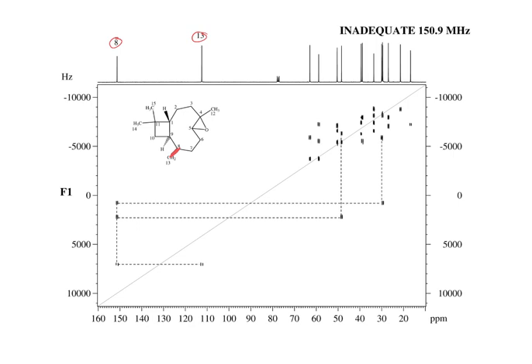Well, I guess this experiment is run to observe all those sizes of coupling constants for some reason. It seems like oftentimes in the pulse sequences there is some delay that's related to the coupling constant. Remember, we had these delays of 1/2J or something like that. So we cannot use a table, just looking at this. Those were just examples.